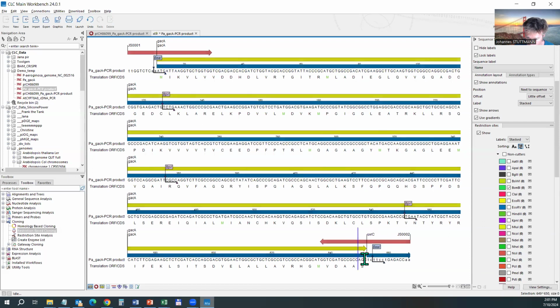So we would have now here AGC, the last serine of GAG-A, and then 2 new serines that would represent my linker. And now I have a new cloning overhang, TTCC. What does that mean? This can be used to basically glue the 2 PCR products together in the middle in a new cloning.